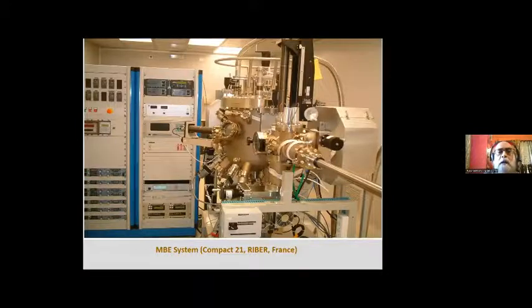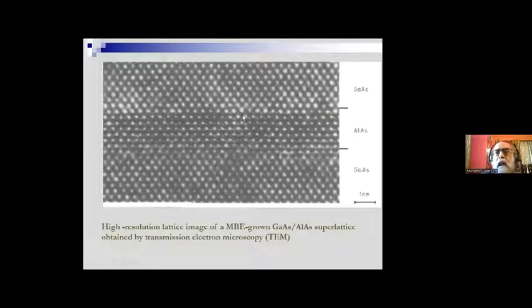Okay, I will not go into more detail, but as you can see, this is a simplistic diagram of aluminum arsenide and gallium arsenide, a quantum structure. This is a quantum well structure. This is the aluminum arsenide, and this is the gallium arsenide. You cannot distinguish the atomic configurations, because the atomic arrangement in aluminum arsenide is in line with the atomic arrangement of the gallium arsenide. So this is a crystallographic orientation. The film you are growing follows exactly the crystallographic orientation of the substrate. And every substrate, every film, has an extremely symmetric atomic arrangement.